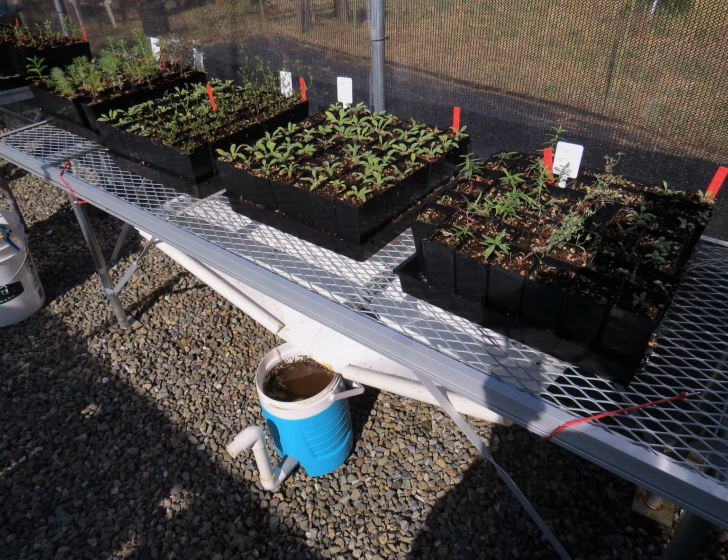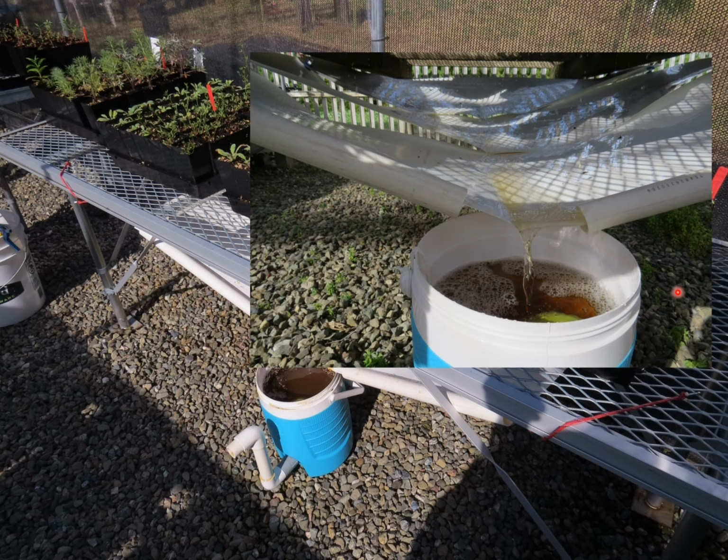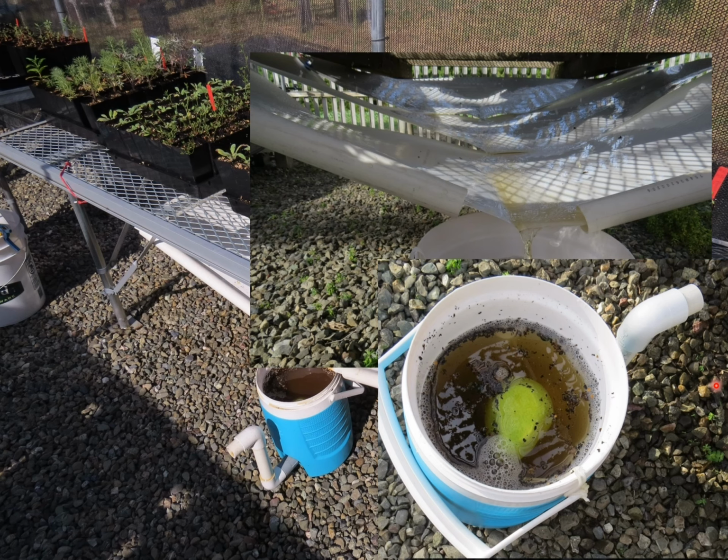So knowing something about the behavior of zoospores and the disease process, Phytophthora root rot in nursery plants, we're able to develop a fairly simple yet effective method to collect zoospores and concentrate them in a vessel that's baited with a green pear. We have the collection surface tied underneath this nursery bench, and it drains into a zoospore collection vessel when the plants are watered and leachate runs out from underneath these. The pear floats in that vessel, and the zoospores can be attracted to that and infect that pear.